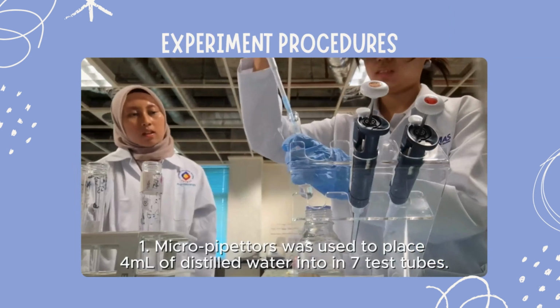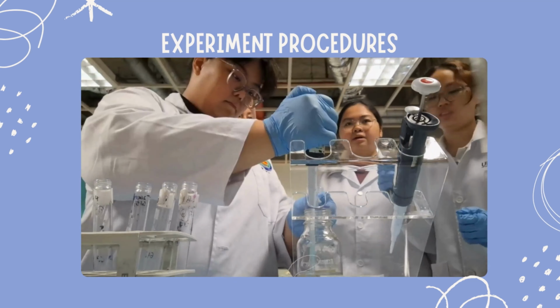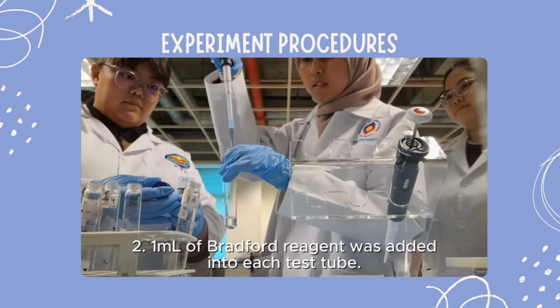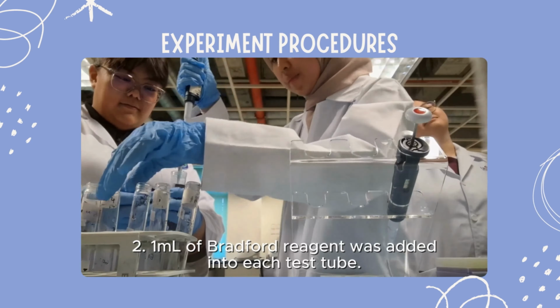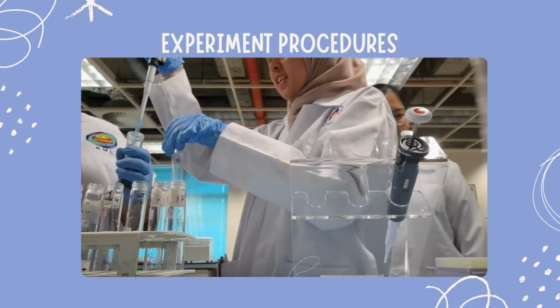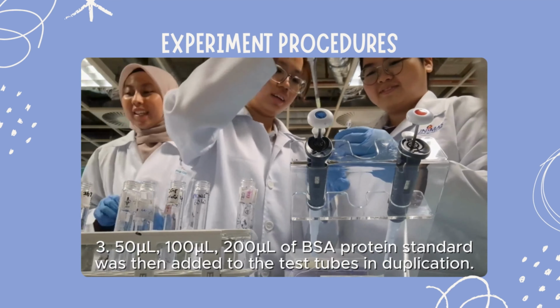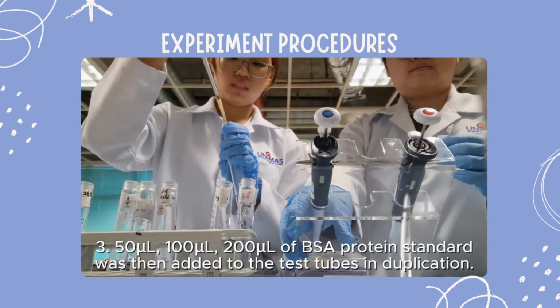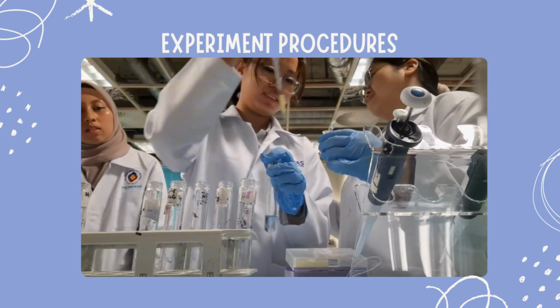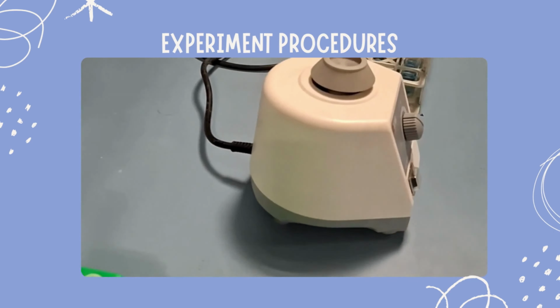In part 1, micropipettes were used to place 4 ml of distilled water into 7 test tubes. Next, 1 ml of Bradford reagent was added into each test tube. 50 microliters, 100 microliters, and 200 microliters of BSA protein standard were then added into the test tubes in duplicate. Each test tube was well mixed using the laboratory mixer.